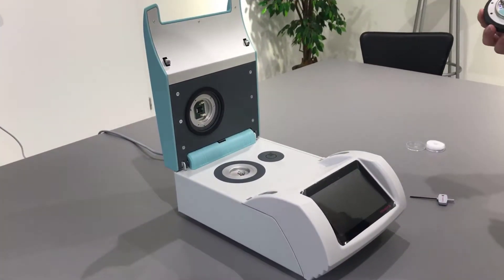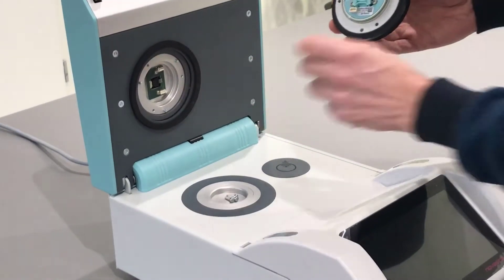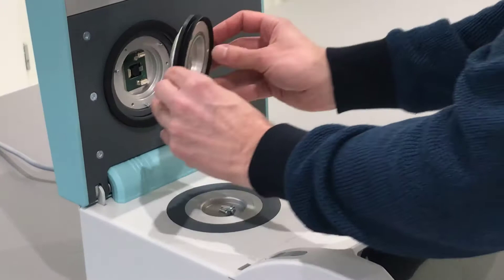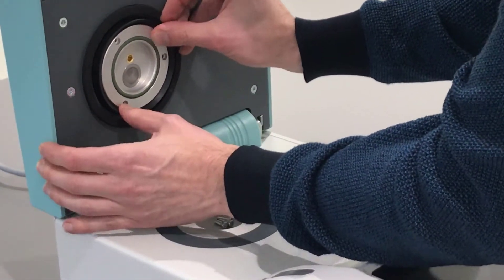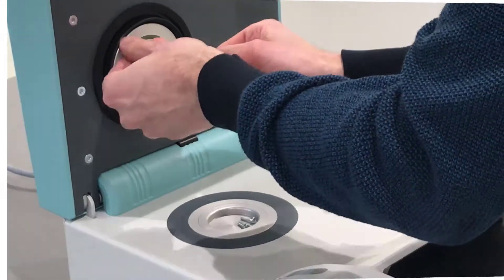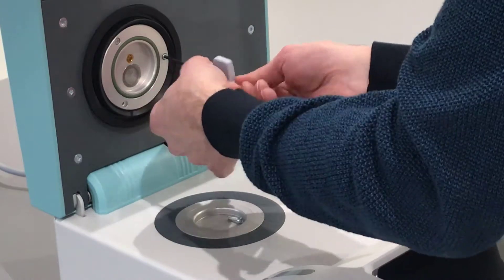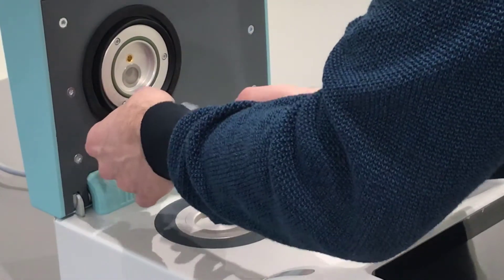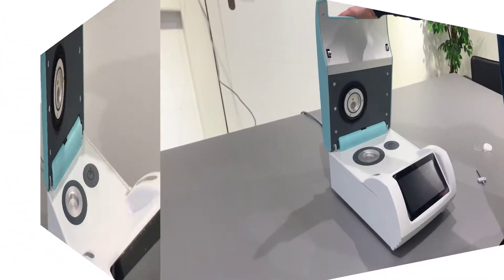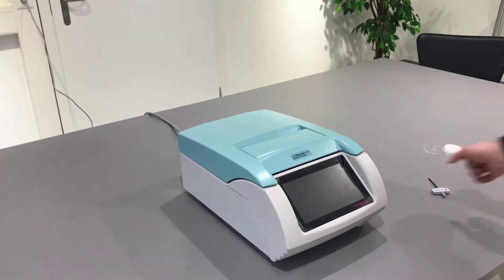Mount the sensor head back to the upper part of the LabMaster AW Neo. Please pay attention to the pins and connector — there is only one way you can mount it in. Take the three screws to secure the measurement head and use the L&K to tighten the screws. However, make sure you do not apply too much force. Once everything is back in place, close the instrument and switch it on.